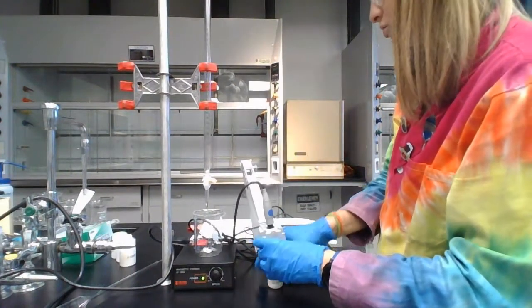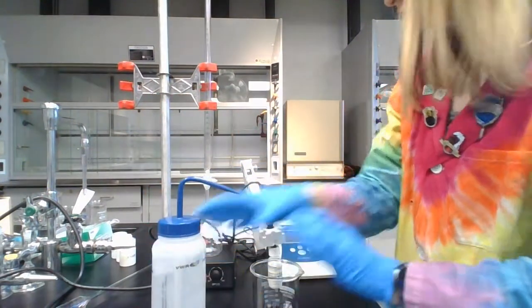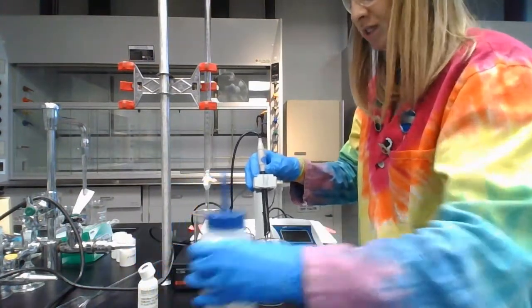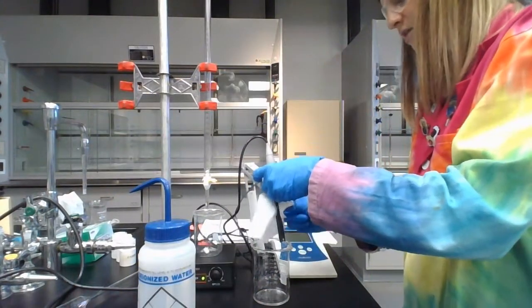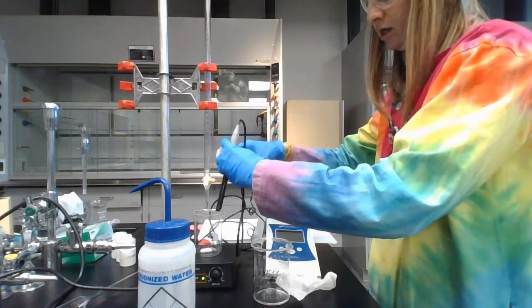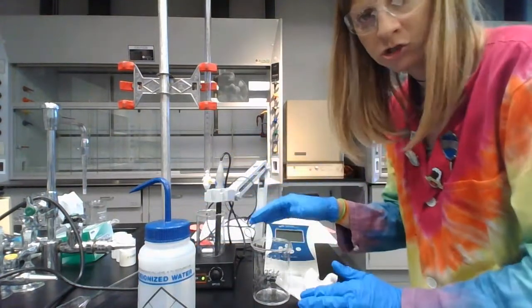You're going to remove it from the potassium chloride solution that it starts in. Rinse it with DI water over the waste beaker. Use a chem wipe. Dry it. And then you will need to get it submerged in the liquid. So the glass bead is submerged in the weak acid.